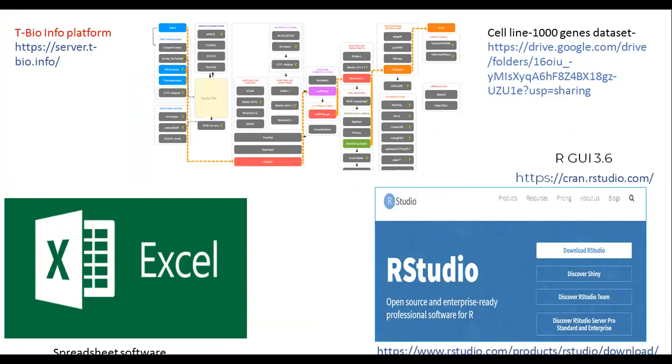So in this session, we will be combining T-Bioinfo platform usage, creation of pipelines and output results with tools like spreadsheet software, for example Excel, and RStudio to conduct further data analysis. Regarding the spreadsheet software, you can use any spreadsheet software you have on your computer.